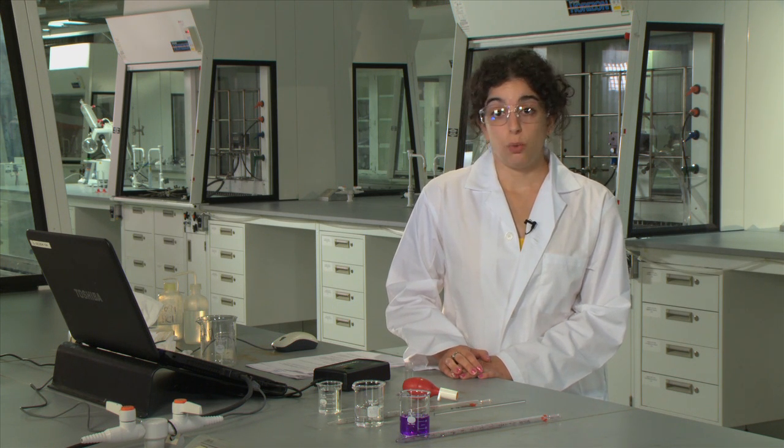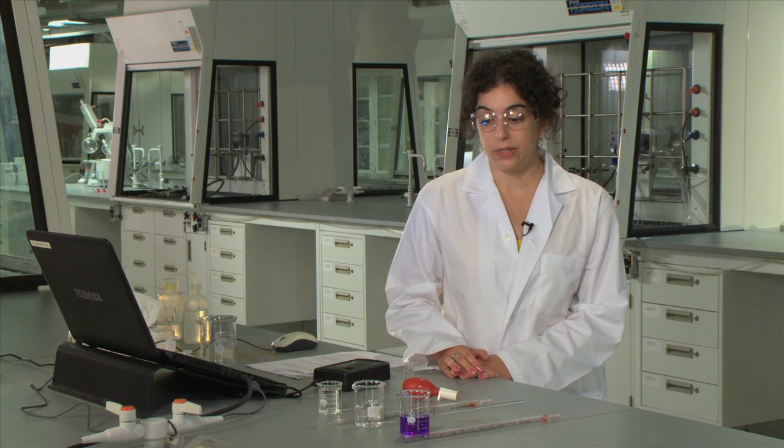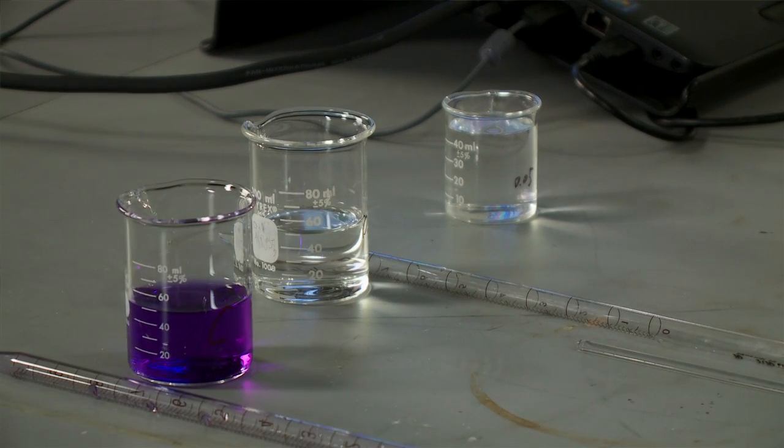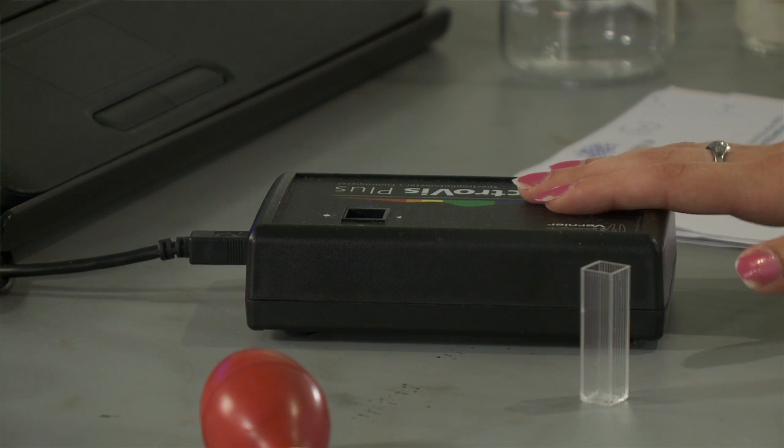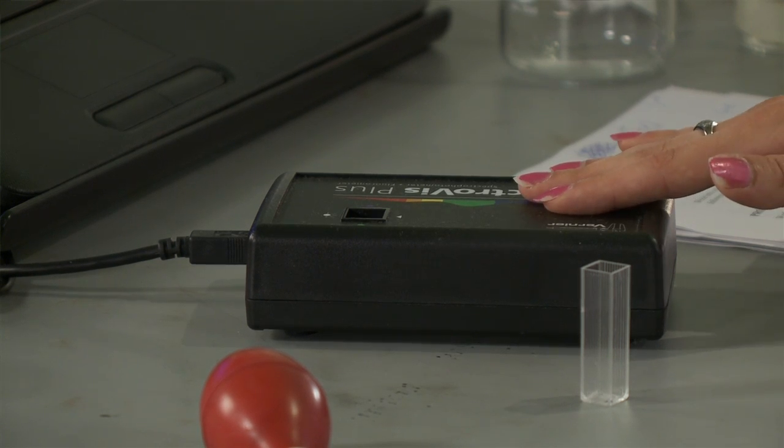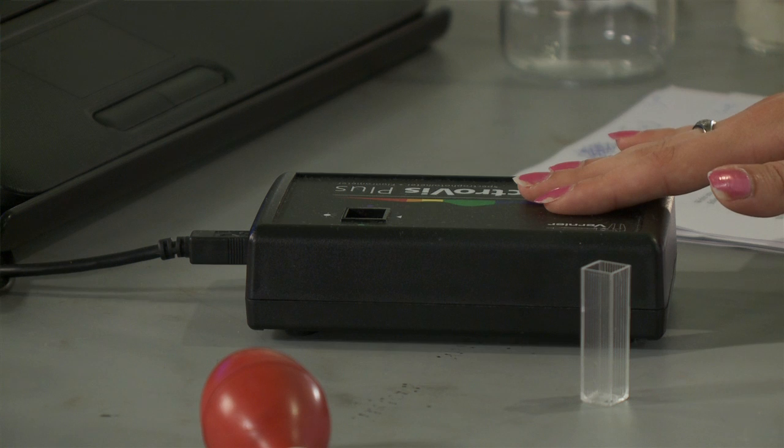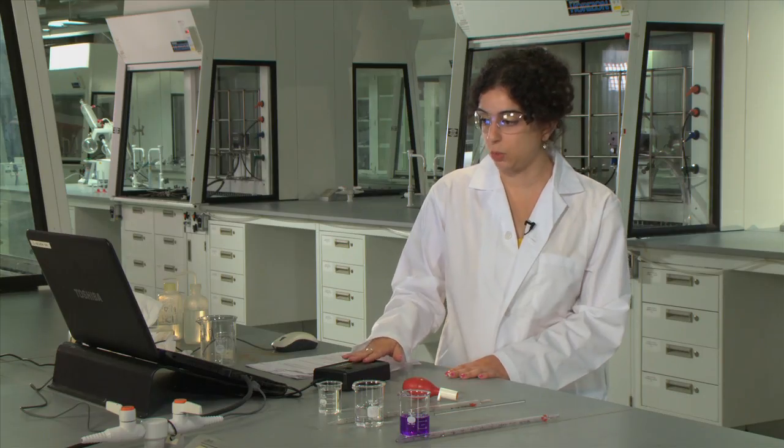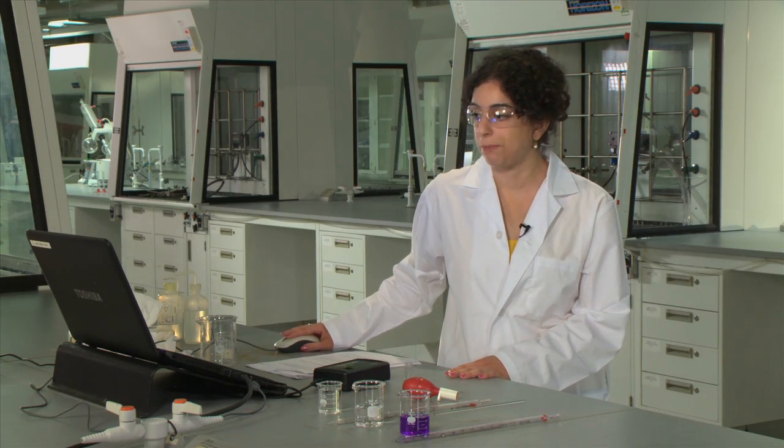The reaction that we'll be looking at is the one between crystal violet and sodium hydroxide, and we will be using a spectrometer to measure the absorbance of this reaction, as well as the Logger Pro software.